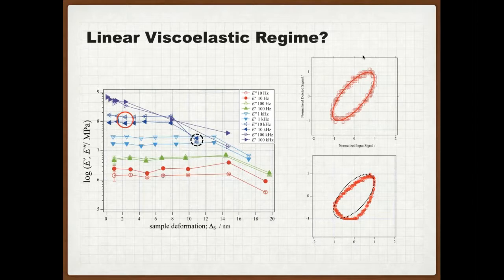Ken, do you have any comment about that? Yeah, it's really depending on the contact area. So depending on the material and the properties, if soft samples, then if sample deformation is big, then the contact area also increases. So in this case, you need to restrict the maximum force during this nano DMA measurement, which must be very small. But anyway, in my experience, at the current stage, the spatial resolution is 20 or 30 nanometers.